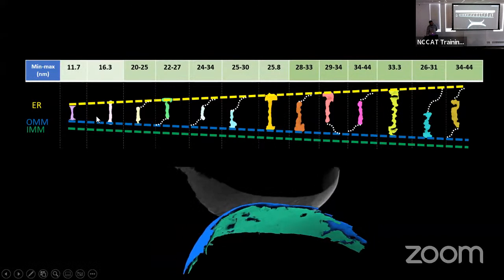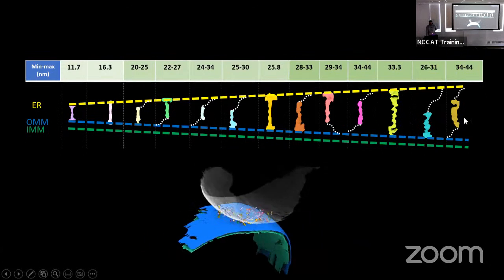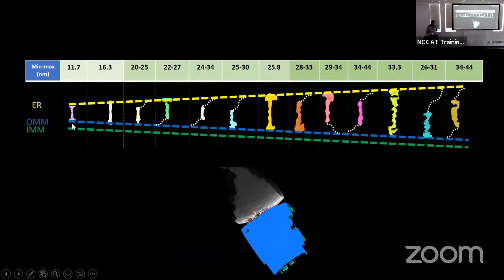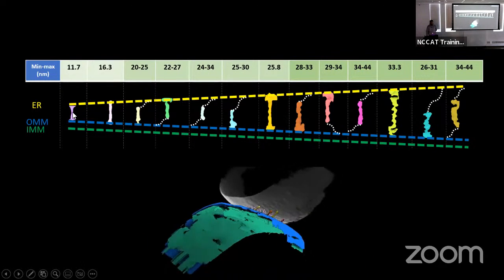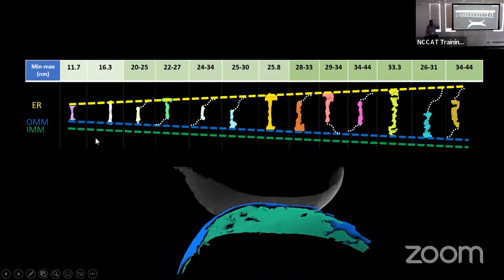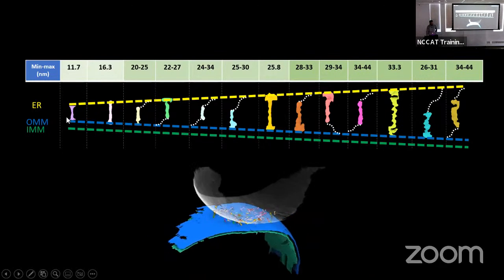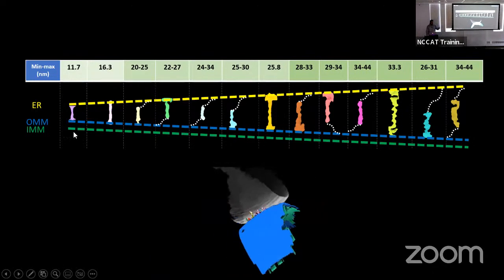You can see that I was able to capture some of the complexity of these tethers, but the resolution is low, obviously. And I think the greatest takeaway lesson from this is that the two interacting partner model doesn't really hold, because you can easily fit two proteins in the smallest one and still have some free space.